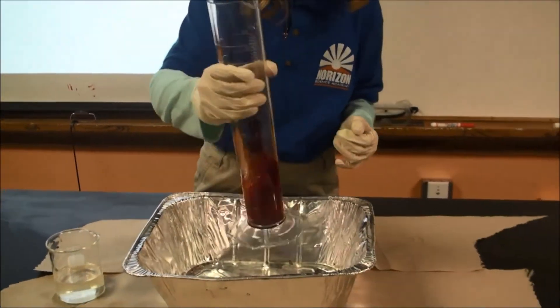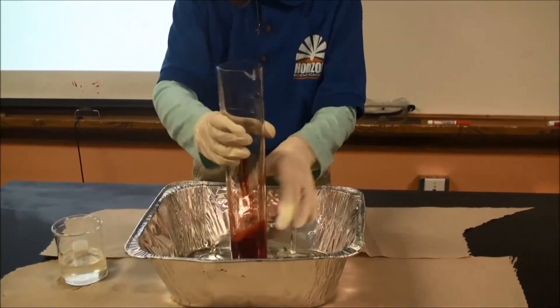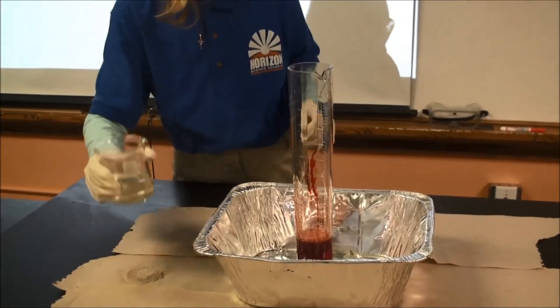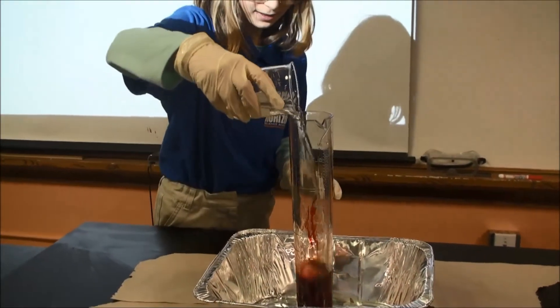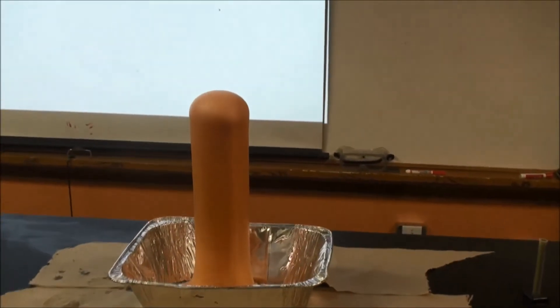And I'll shake this up. And this we're going to pour the whole thing which is up to 100 milliliters, and we're going to do it really fast. That's how it works.